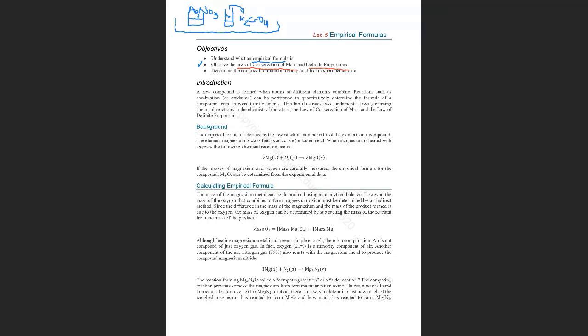And just to give you an example, let's say I do that. I place them on an analytical scale, and I record the mass, and it says that the total mass is 104.5 grams, just to give you an example. And then, after I record the weight, I will pour this liquid of potassium chromate inside the beaker that has silver nitrate.